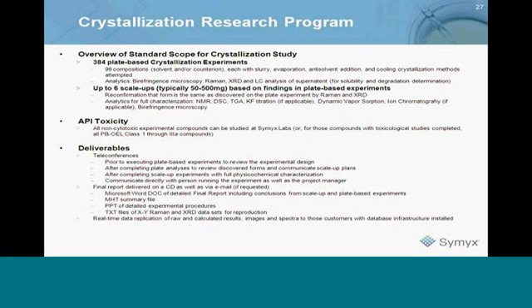We can handle any non-cytotoxic experimental compounds we study in our own labs. And from this, then, we would also do a variety of teleconferences and a full report. All these are capabilities we've also enabled with customers, so we've decided to bring in the equipment and the software. We've enabled this with a full training program and support as well. And so these are all things that we've done. We have people that have started with using our services to do a feasibility and prove the concept, to understand how the technology works.